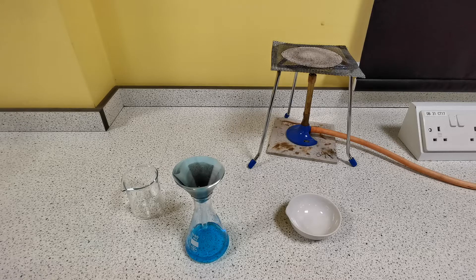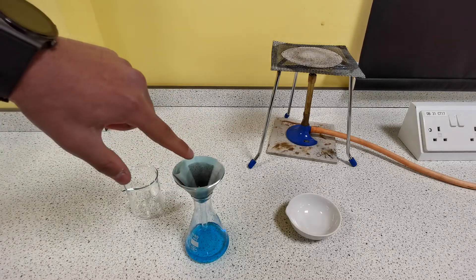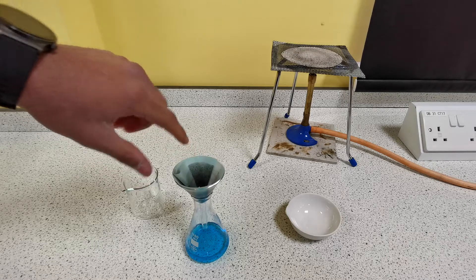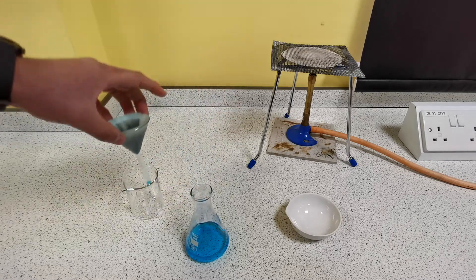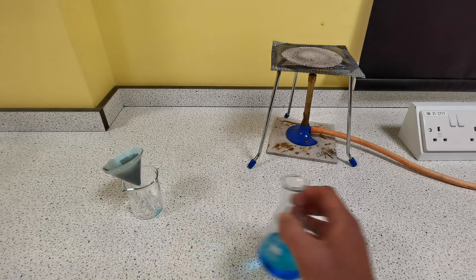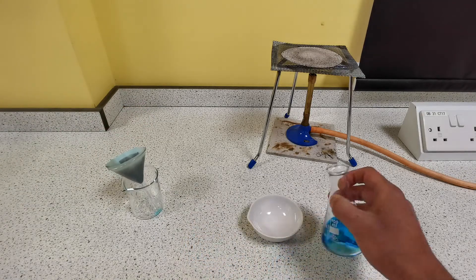After the filtration of the mixture has finished, you can see all the black copper oxide left as the residue on the filter paper. Pour the copper sulfate solution into an evaporating basin.